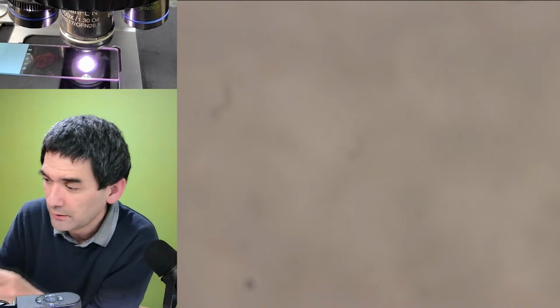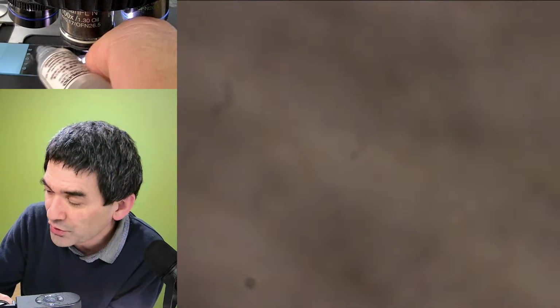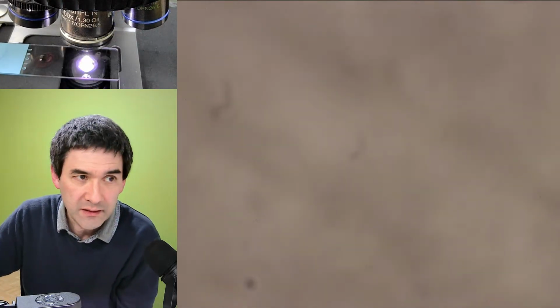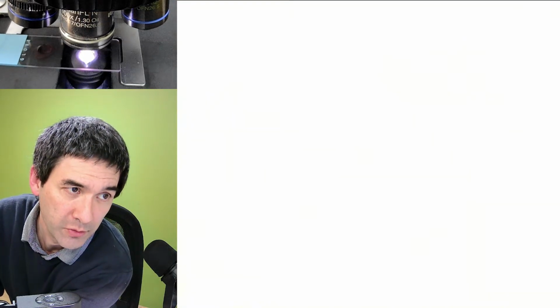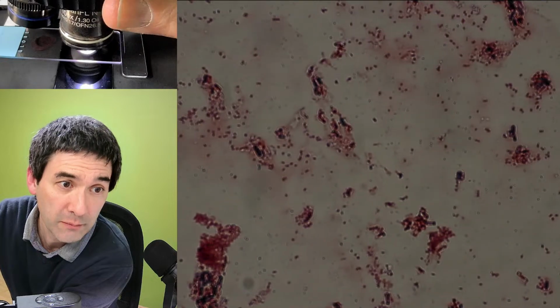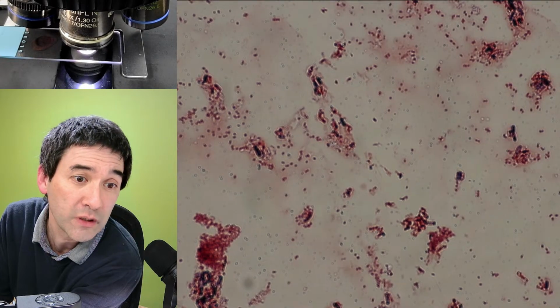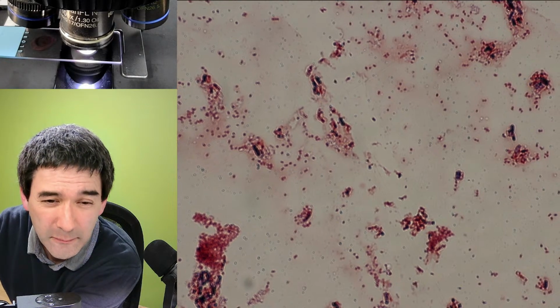Here's my immersion oil. A drop goes on here, and a drop also goes on the other one. Now I'm going to rotate it up again until the topmost position, which it remembered. Boom. You see it lost a little bit of focus, and here we go. You might want to move it a little back and forth, and you see that the image quality is much more clear than before.